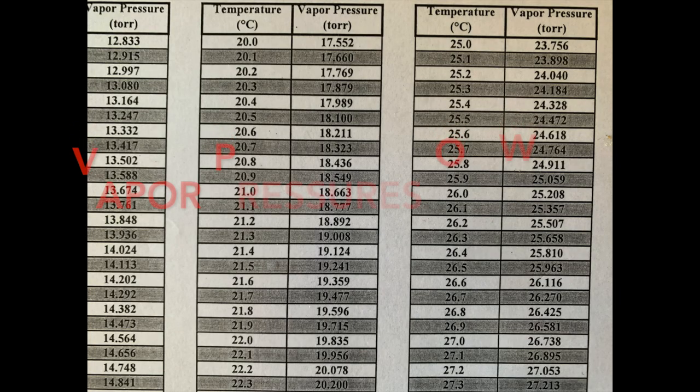Because we'll be collecting the gas from our lighter over water, there will be water molecules in our collected sample. We'll need to use Dalton's law to subtract out the vapor pressure of that water at a specific temperature.